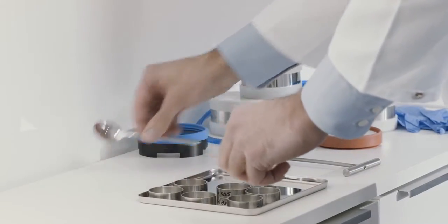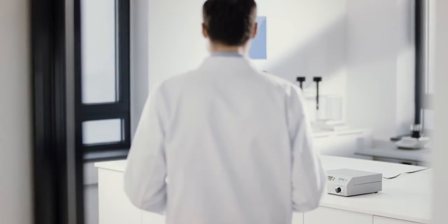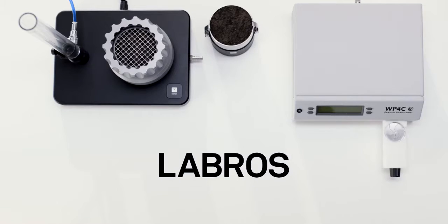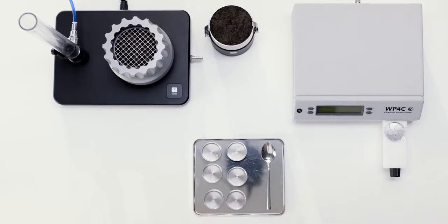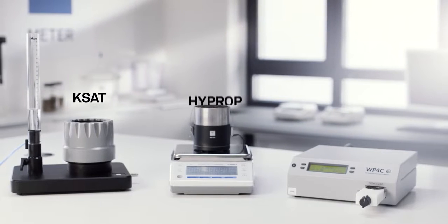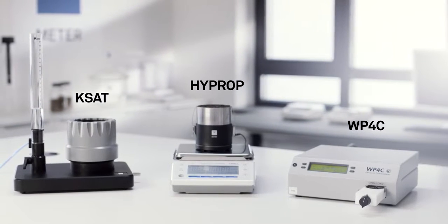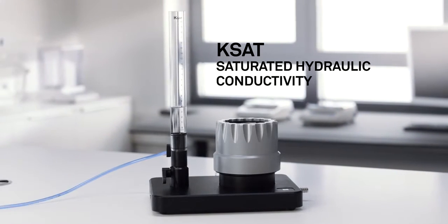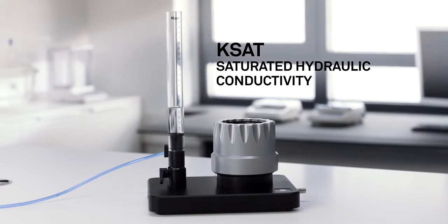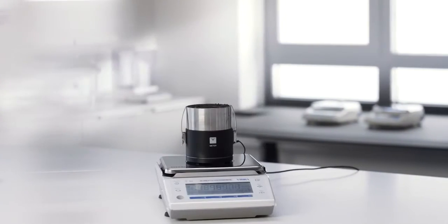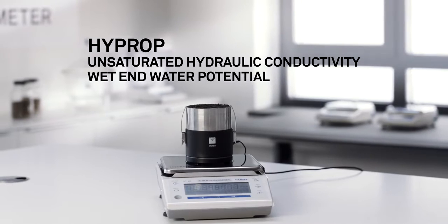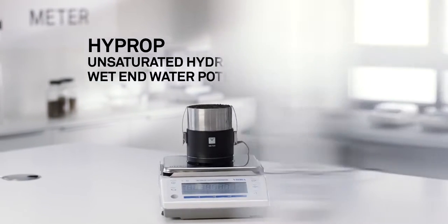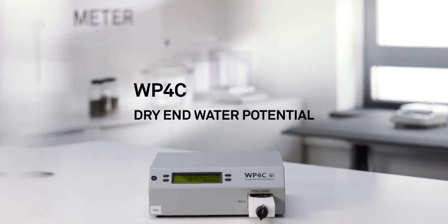Being a true specialist means to focus to achieve the best possible results. That's why specialists love Labros Meters' innovative soil science laboratory collection. Each instrument is designed to perform a specific task as precisely and simply as possible: KSAT for saturated hydraulic conductivity, HyProp for unsaturated hydraulic conductivity and wet end water potentials, and WP4C for dry end water potentials.